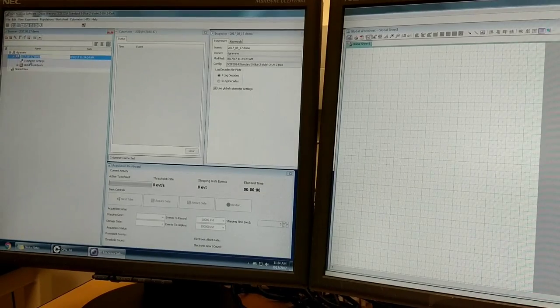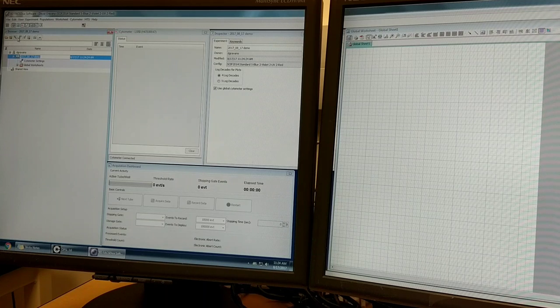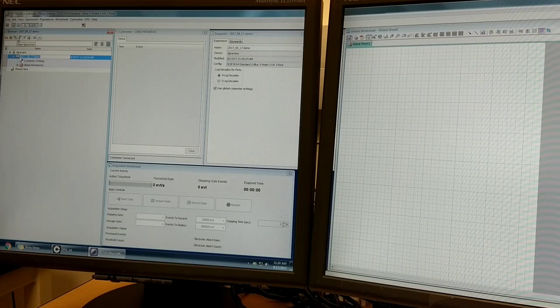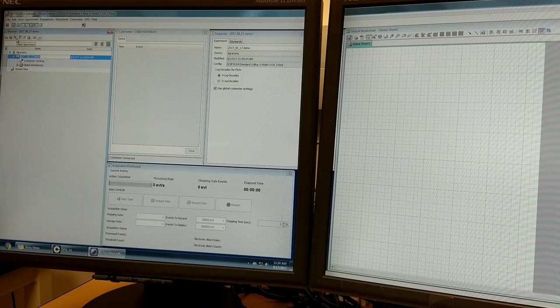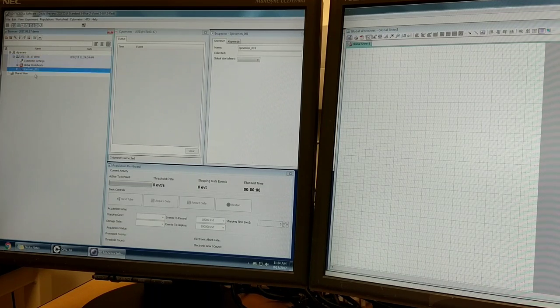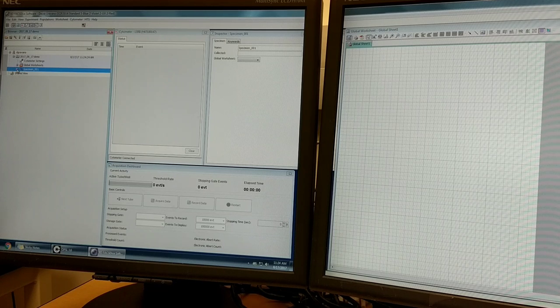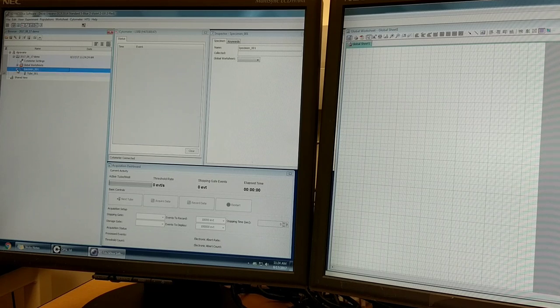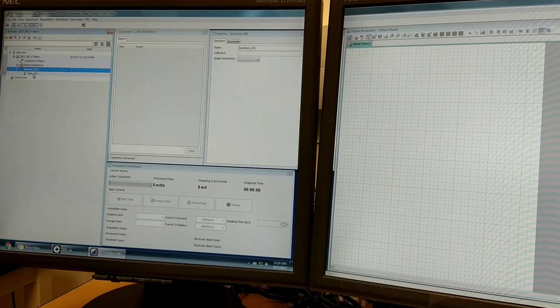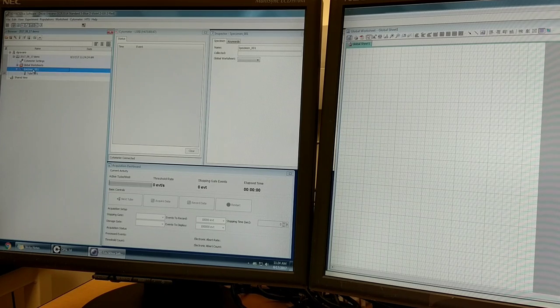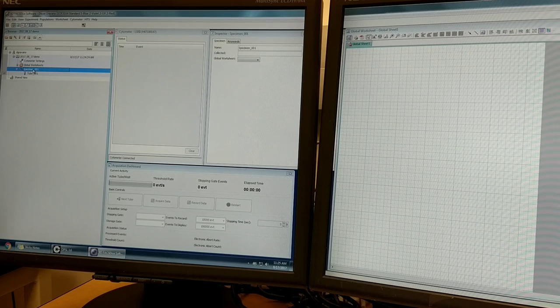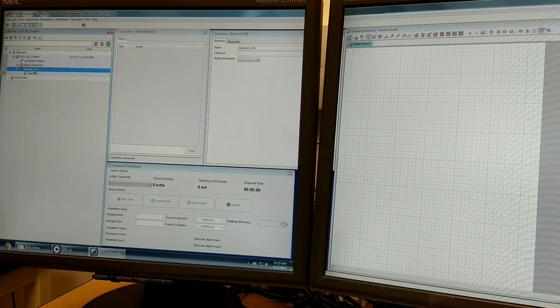Now within this experiment, the next step is to create what's called a specimen. That's this syringe symbol in the browser. You can click on the plus symbol to expand it and you'll see there's a tube under the specimen. The specimen can be thought of as a group of tubes.